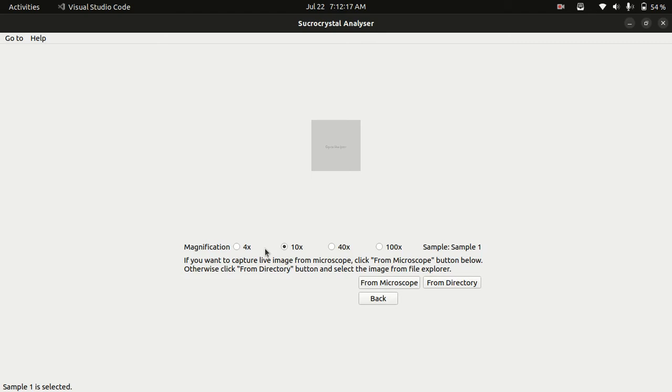We will select that magnification on which the microscopic image is taken. I will select 10x for my case.